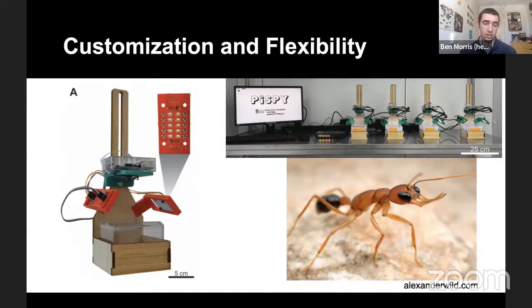So in our case, we really are using these devices to study the Indian jumping ant. So we don't need some of the functionality that came from the more general model that we now have as our base model. So it's only ever imaging from the top with the LED PCBs attached, because again, that white and red light cycling will mimic day-night cycling for ants. And the stand nicely fits around the nest boxes that we use, because we're always using nest boxes of the same size.